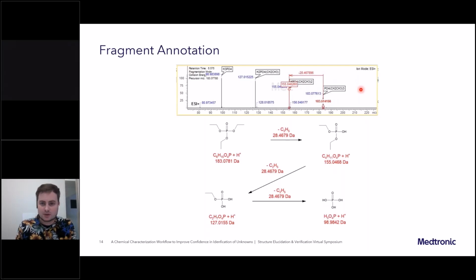Another tool at our disposal that we use is to look at differences between the various fragments, which you can see here, to look for various patterns that might give us more hints as to what these fragments are.